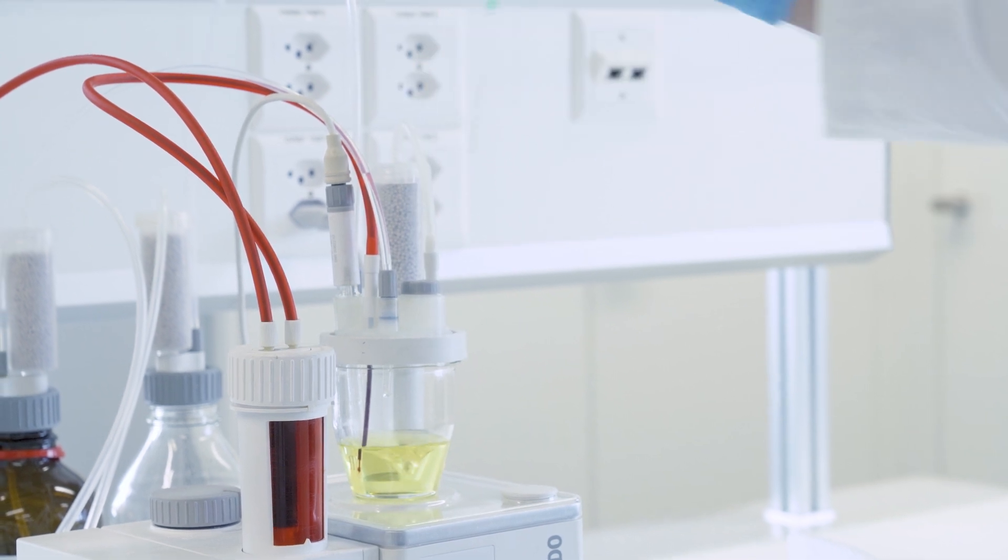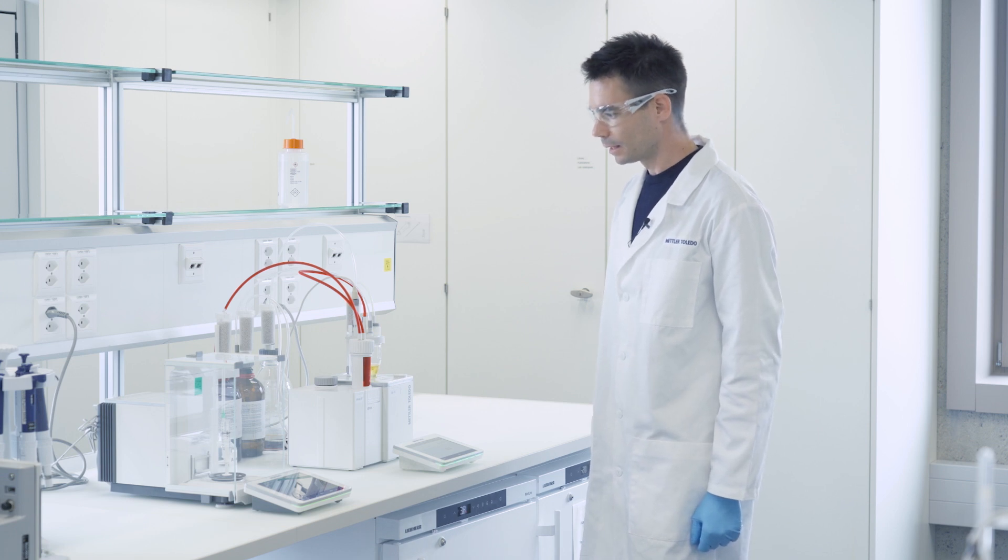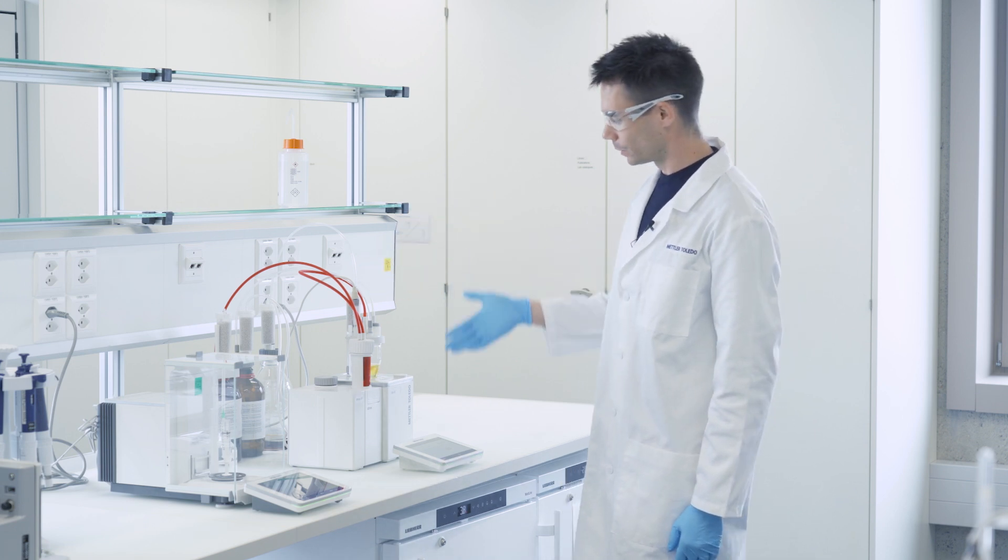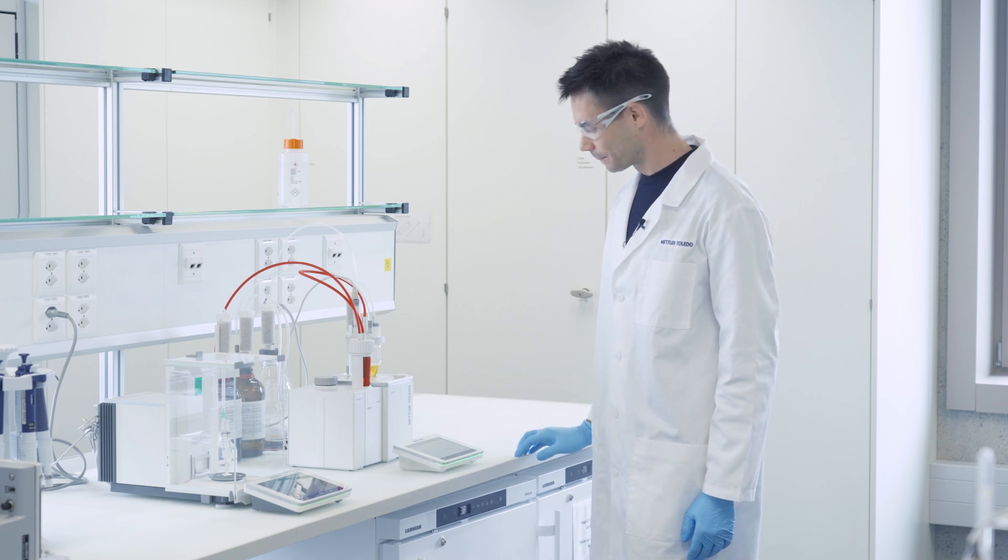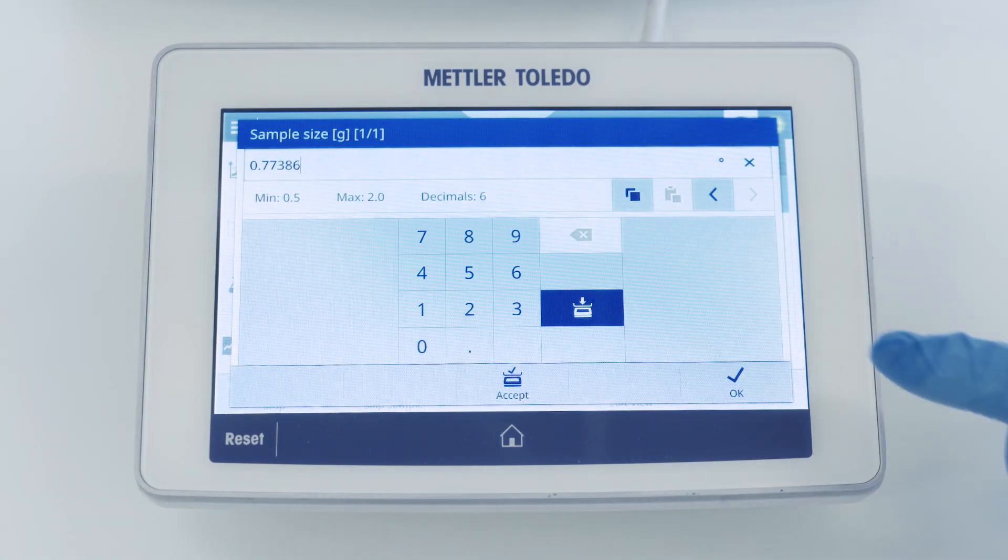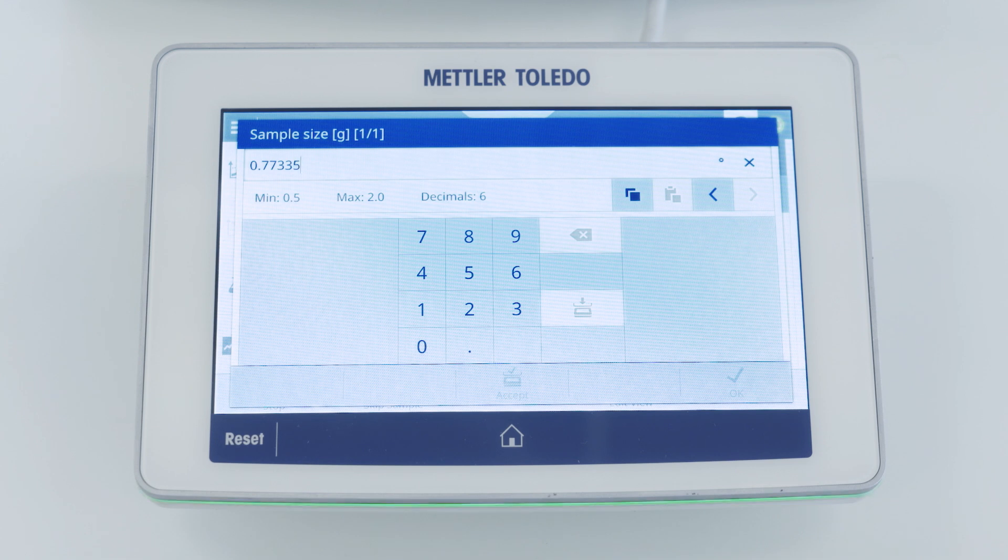We put the syringe back on the balance. And because the balance is connected to the titrator the weight is transferred automatically and we can just accept the weight as soon as the balance is ready. In the background the titrator has already started the titration because it only needs the sample size at the end for the calculation of the water content.